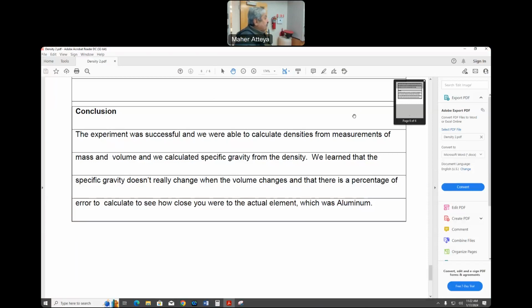Any question you have? I spent a longer time because that's the way we'll set up all our experiments. So the experiment itself will not take 15 minutes. Then you are done because you are measuring just this, correct? The other stuff you can do at home, and I just posted some of them for you. The watch glass, the beaker in 2 balances, reading this, measuring this, and you are done. It should not take half an hour.